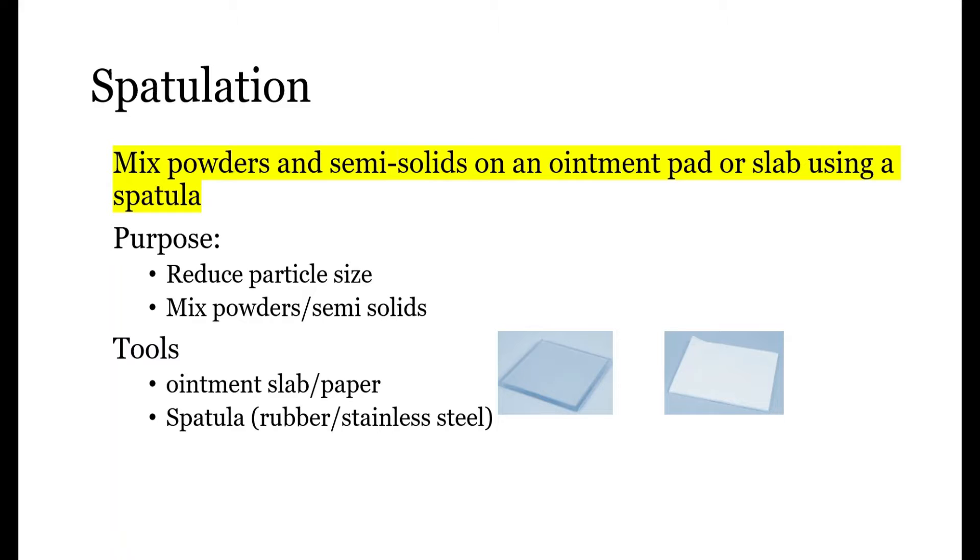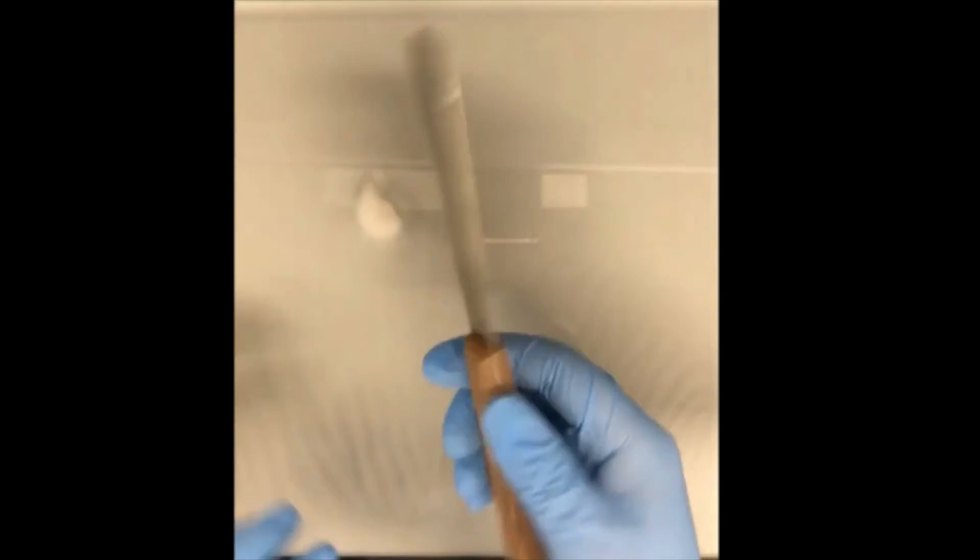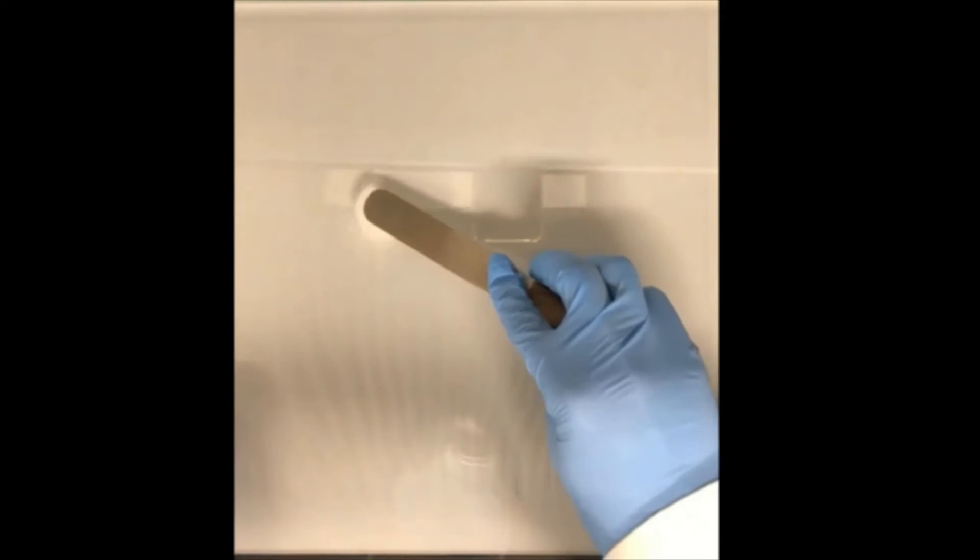You can use the glass slab or you can use ointment paper. The spatula can be made of rubber or stainless steel. In this case, we will use glass slab. To do the spatulation first, we need to put a powder to be spatulated on the slab. Next, we can utilize a stainless steel spatula to spatulate the powder by pressing or grinding the powder in a circular way.